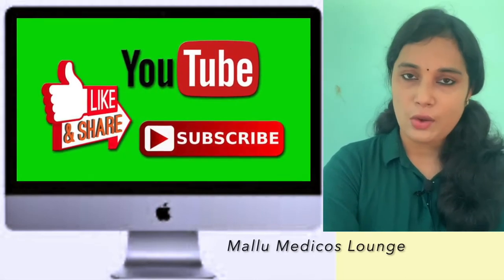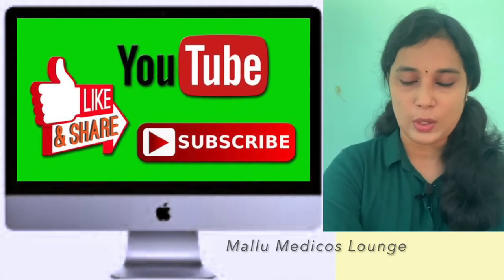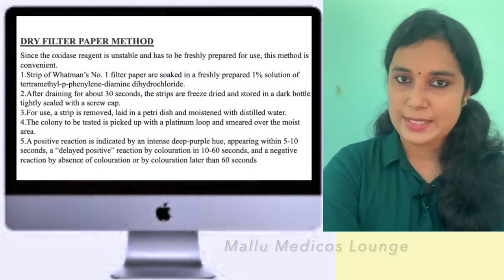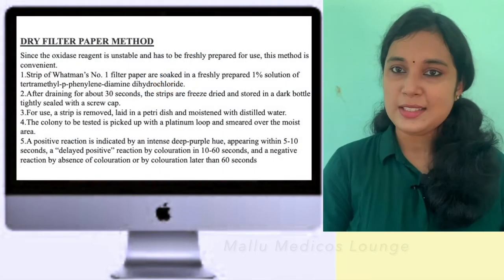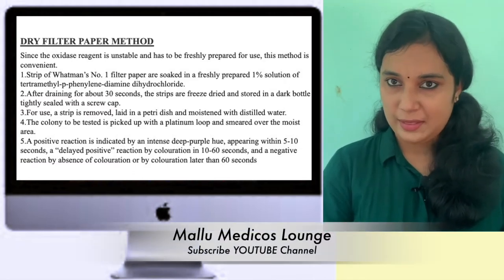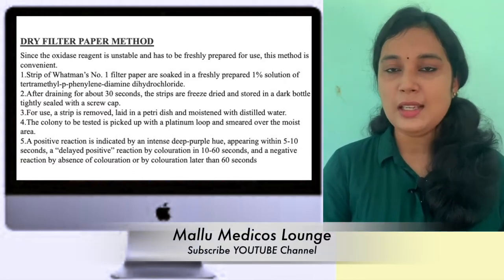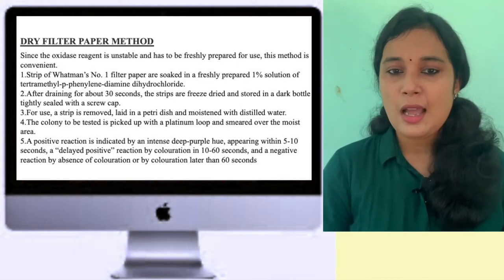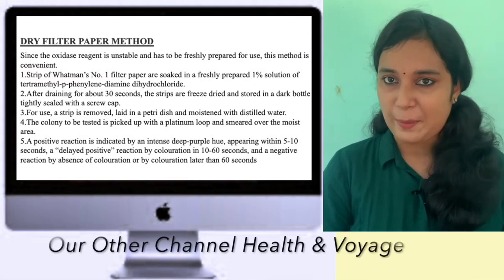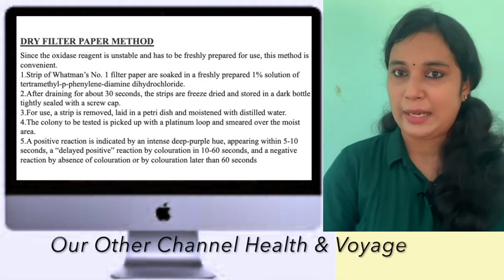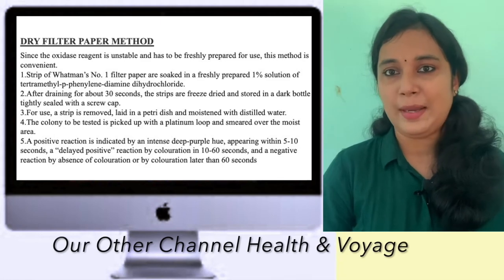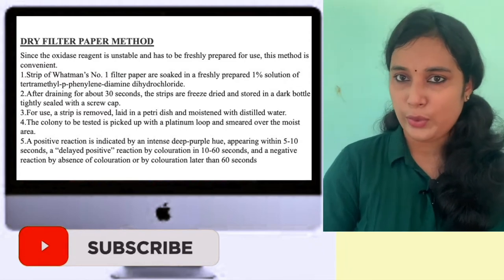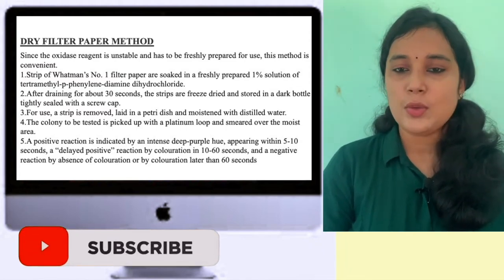Now we will do the Oxidase Test. The first procedure is the dry filter paper method. We cut filter paper into strips and saturate them with freshly prepared 1% TMAD solution as the oxidase reagent. The reagent must be freshly prepared because it is very unstable.